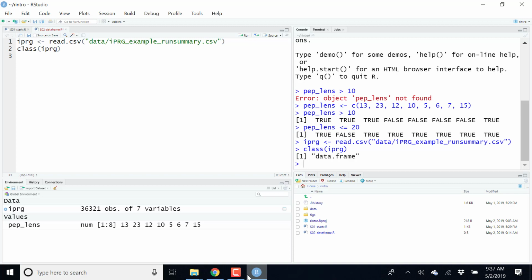but depending on what kind of analysis, what kind of visualization you want to do, this structure might be more useful, and depending on what we want to do, this structure might be a better fit. But it's important to have this notion that whether it's this tidy data or this wide data, they are still structured. And we know exactly that if we take one column here, we get all the intensities of one sample, or if we take one row, we will have that protein and all the intensities across all the samples.